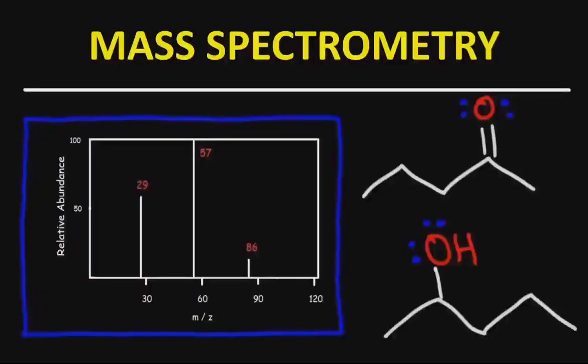So today in this lecture we are going to start with mass spectrometry. It is a broad topic of spectroscopy technique in which we will cover its introduction, its working principle, the instrumentation parts, and its advantages and disadvantages. We will also cover its applications, and at last we will cover important questions that can be asked in interviews and in your examination.